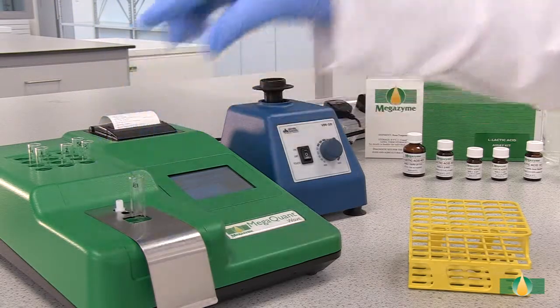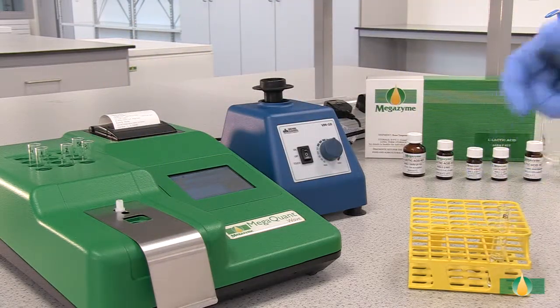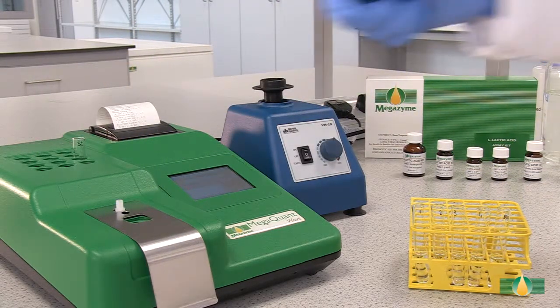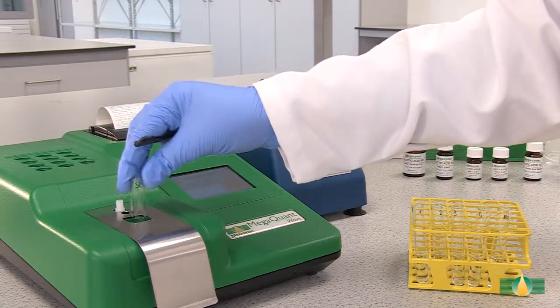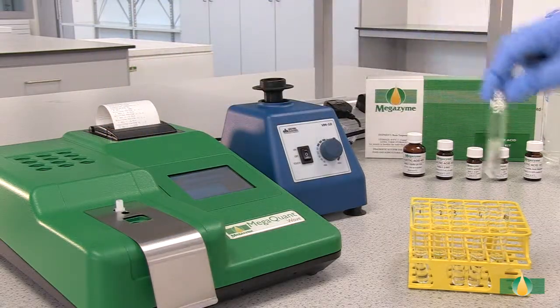After 3 minutes, record the first absorbance reading, A1, at 340 nm for all of the assay tubes. In this demonstration, we are using the MegaQuantWave spectrophotometer set to read at 340 nm.